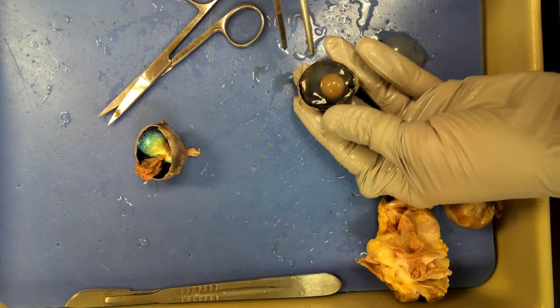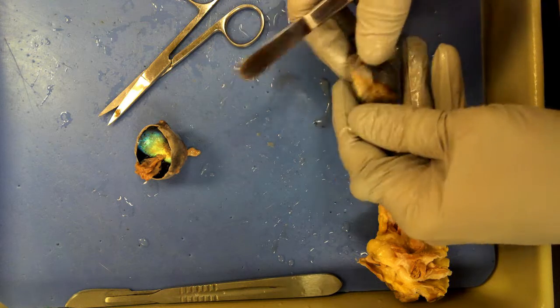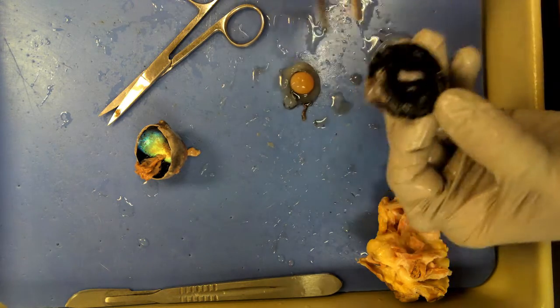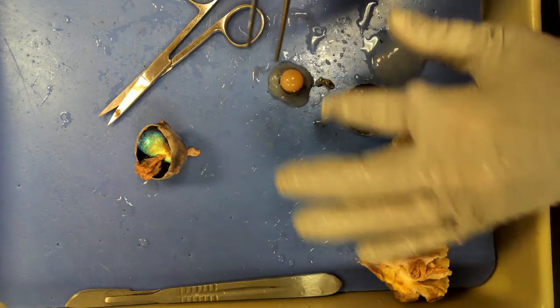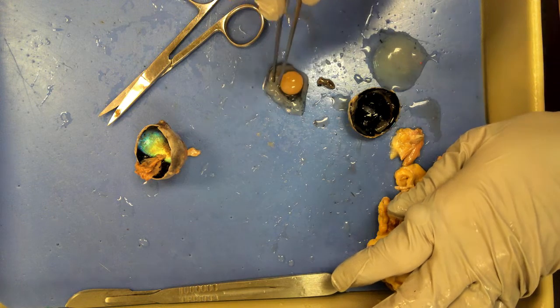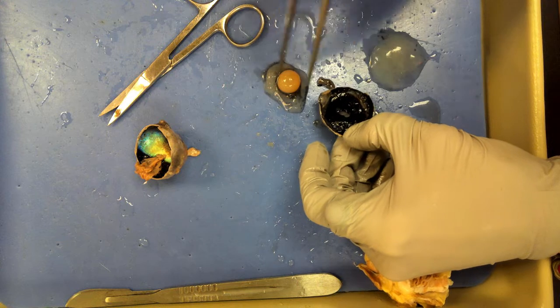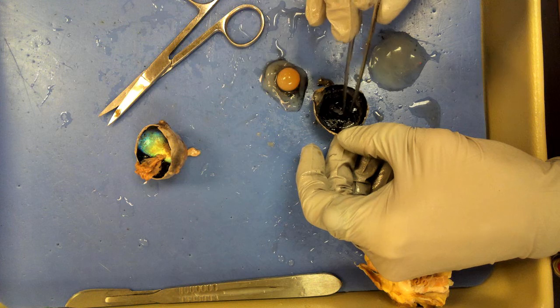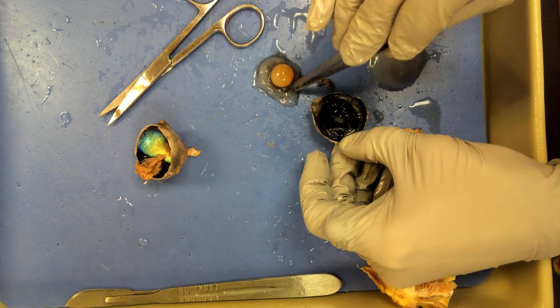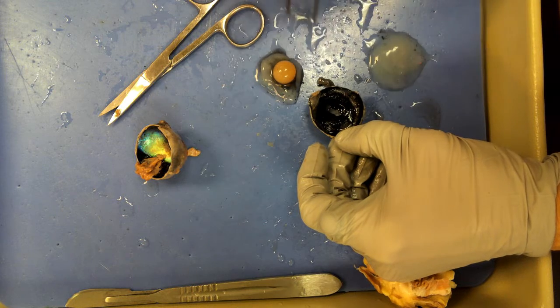Now we're going to go over to this side. That round thing is the lens — it's hard all the way through. I'm going to force it to come out by turning the eye inside out. I wanted you to be able to see the suspensory ligaments and ciliary body. The lens has some vitreous humor stuck around it, but you can see that black stuff — those are the suspensory ligaments holding the lens in place. There are also ciliary bodies, or ciliary muscles. Some of the muscles are still on the eye, but since they're all black, it's easier to see them on the edges of the lens.